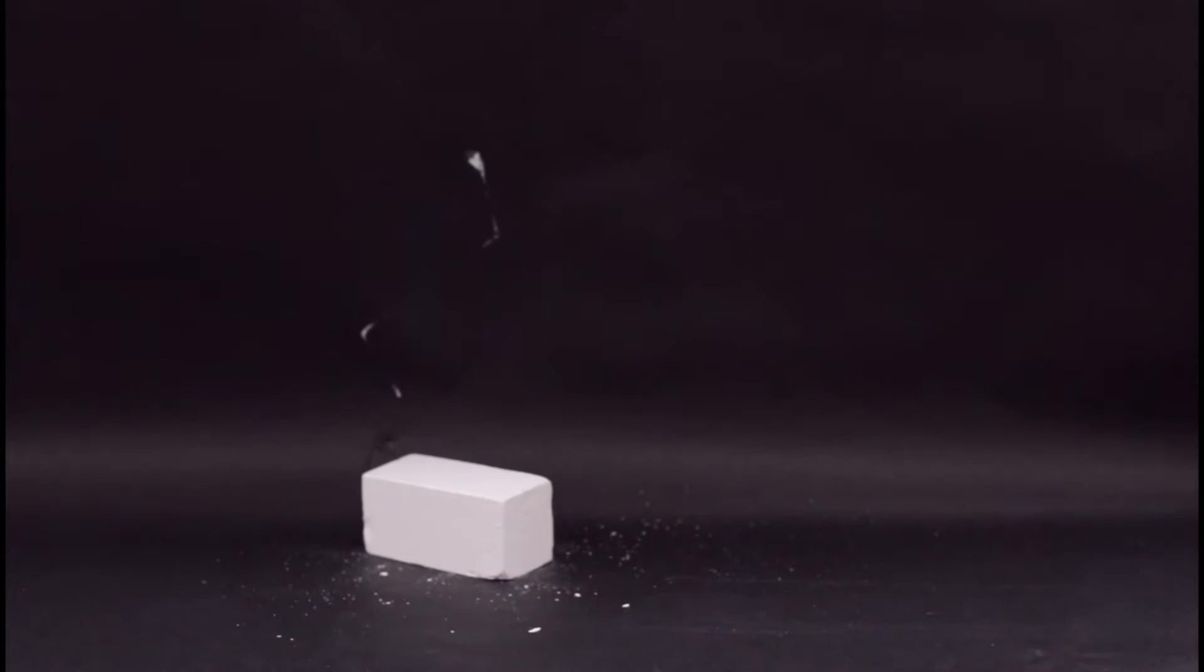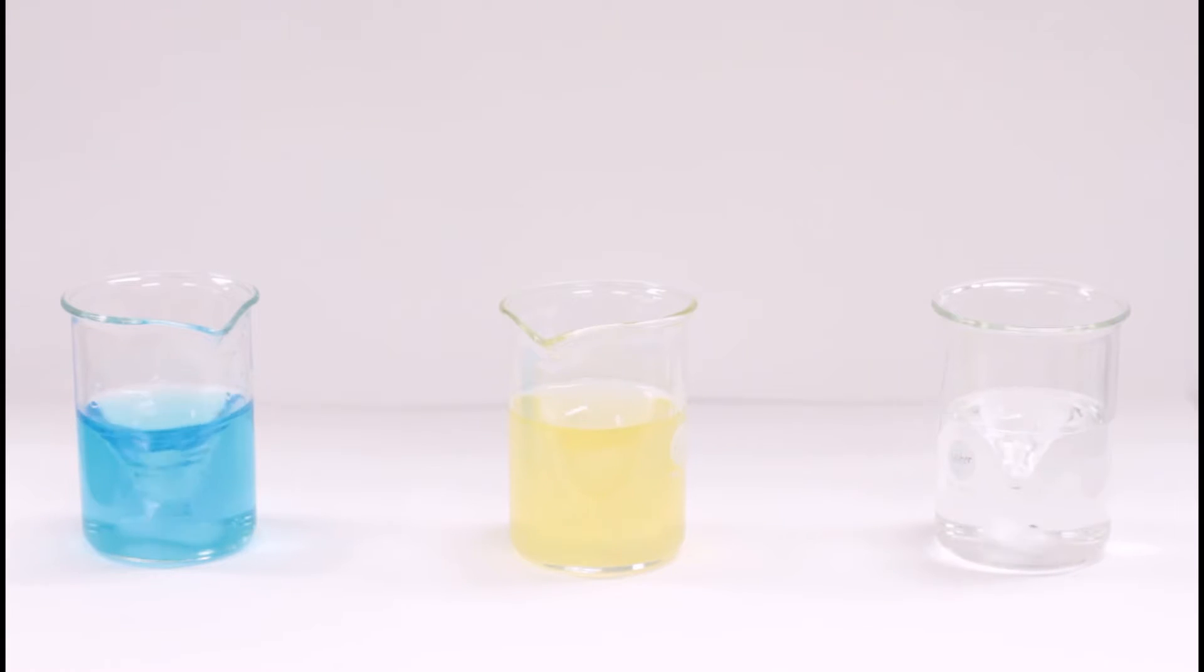A hydrate by contrast will release water vapor. A hydrate is an ionic compound that has water molecules as part of its crystal structure, which generally lends certain properties and colors.